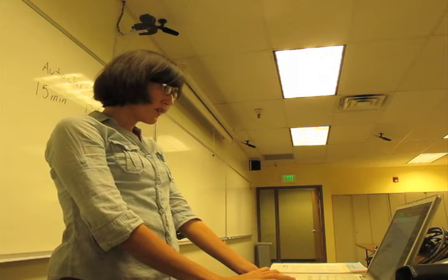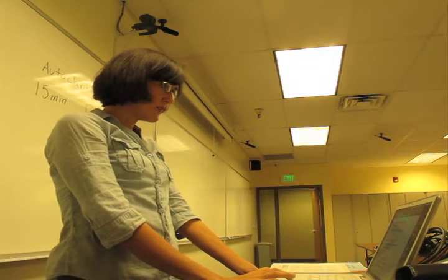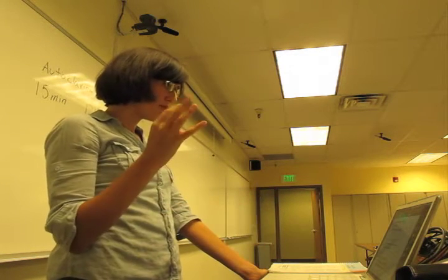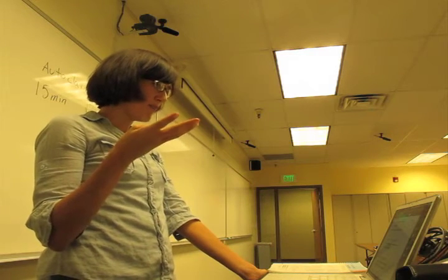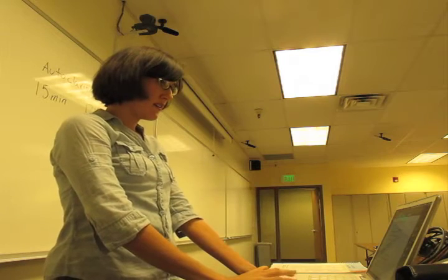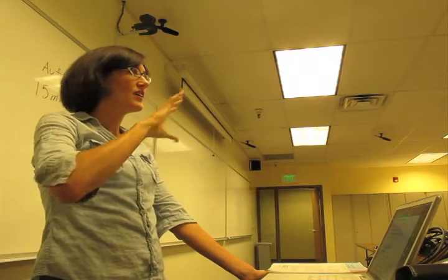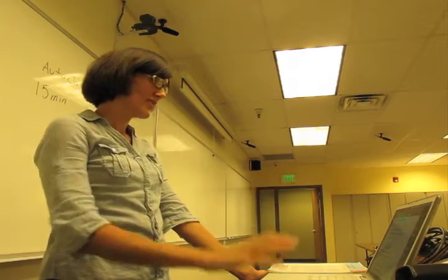So we have 4 different mediums. What mediums are bacteria most easily transported in? Is it the slant? The slant and also the broth culture. Because with the broth culture, you can culture just tons and tons of bacteria. So that's why sometimes they like to use broth.